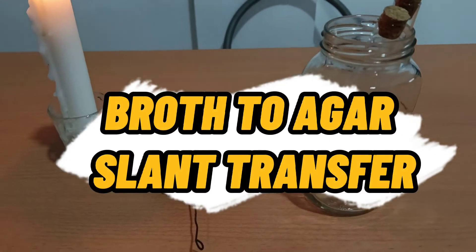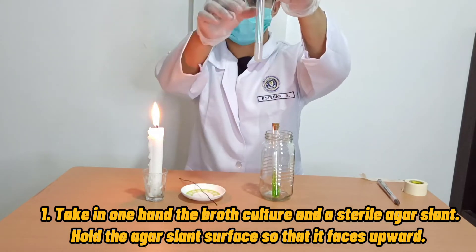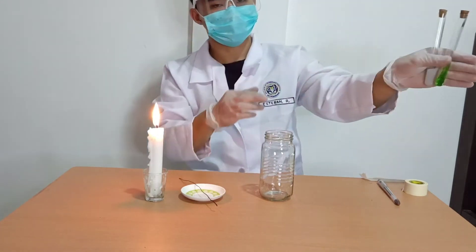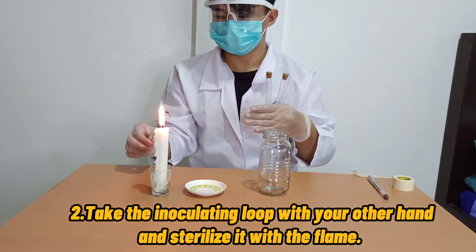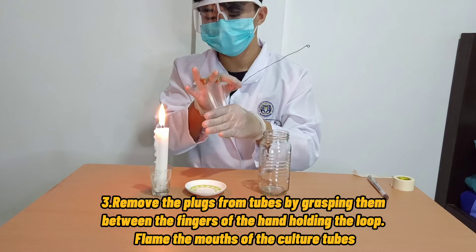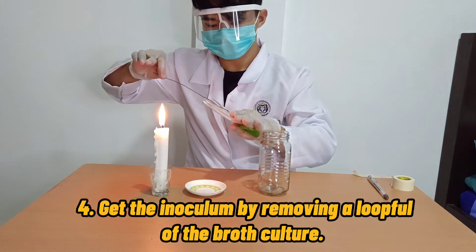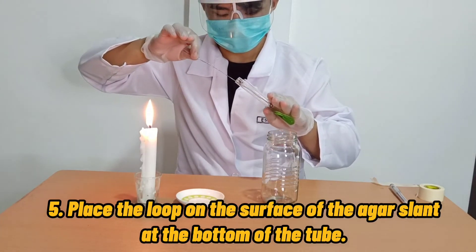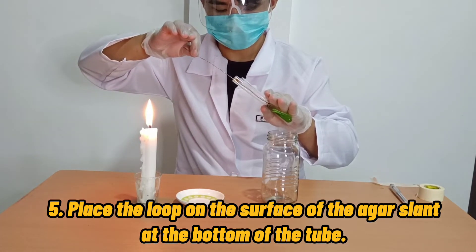And for the third and last, is the broth to agar slant transfer of culture. First, take in one hand the broth culture and sterile agar slant. Hold the agar slant surface so that it faces upward. Second, take the inoculating loop with your other hand and sterilize it with the flame. Third, remove the cotton plugs or cork from the tubes and flame the mouths of the culture tubes. Fourth, get the inoculum by removing a loop full of broth culture. Fifth, place the loop on the surface of the agar slant at the bottom of the tube. Move the loop side to side as you pull it upward out of the tube. Do not dig into the agar.